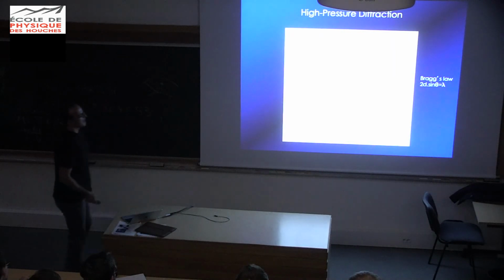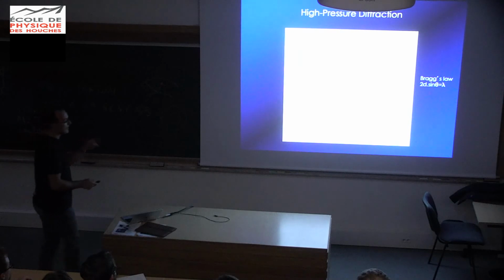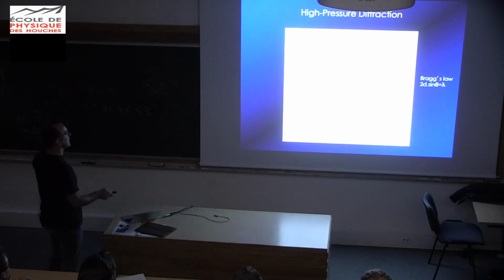Okay, here we go. Here you have the same sample; this is when you load it in the diamond cell, it's sitting at a few GPa, and then you start increasing the pressure, almost getting to a megabar here. What you see is that all those lines shift to higher angles. You also see the appearance of new lines, like a shoulder here. This has appeared, it wasn't here. You have new lines appearing, and this means that your crystal structure is changing.